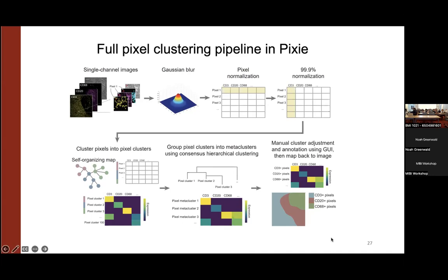But for all the stuff we tried, these seem to work well. I think the other thing is that the intent with this is that Pixie is not really intended to be a means of removing systematic background. The underlying assumption is that the data going in can be viewed as ground truth, right?